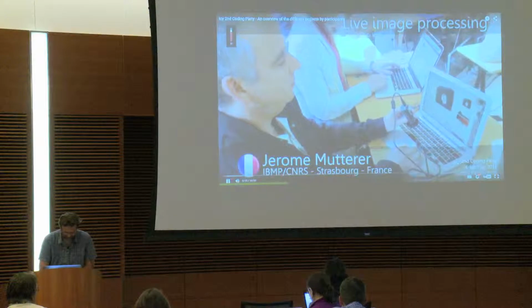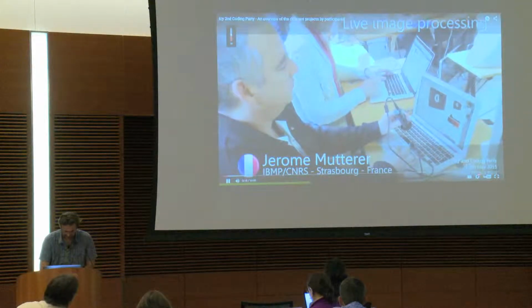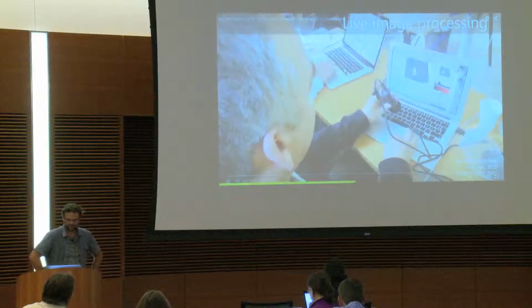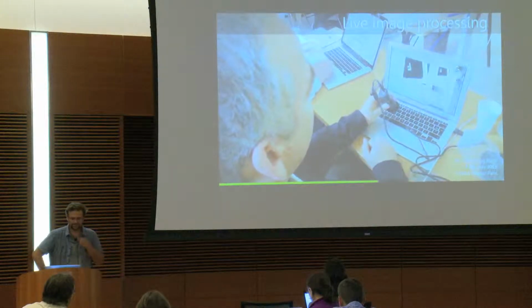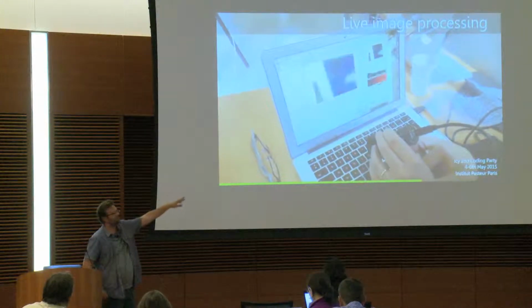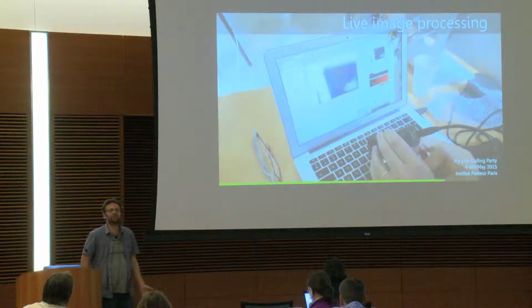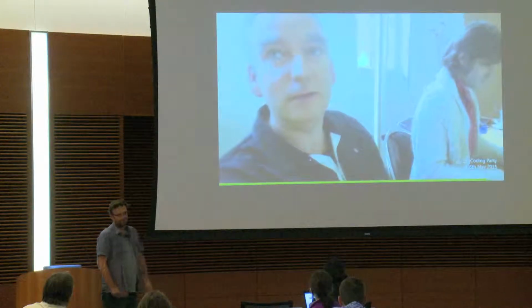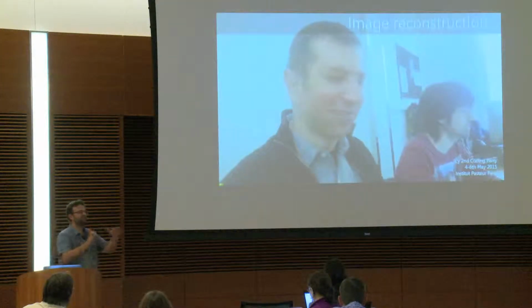Displaying the live feed in the viewer window, and you can turn on live image processing. so this guy is taking an image using a plugin for a webcam input. We have 3 different kinds. And then he put it in a protocol.